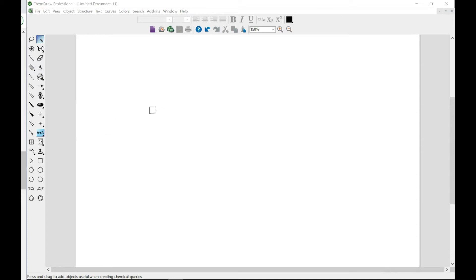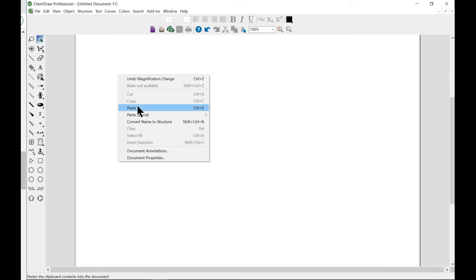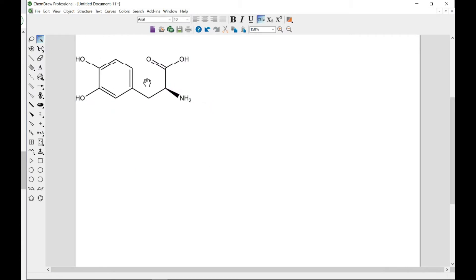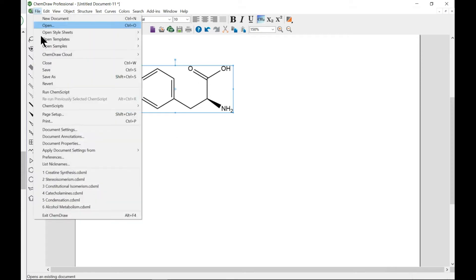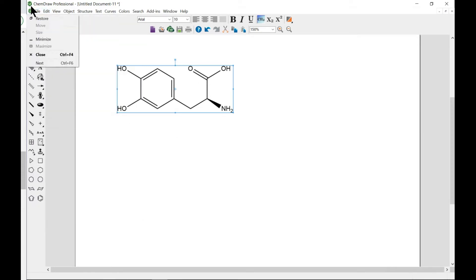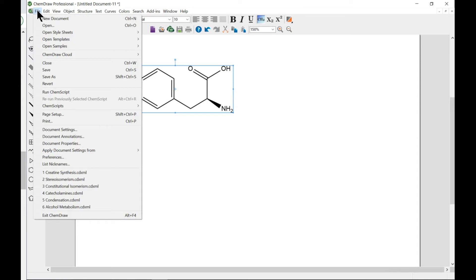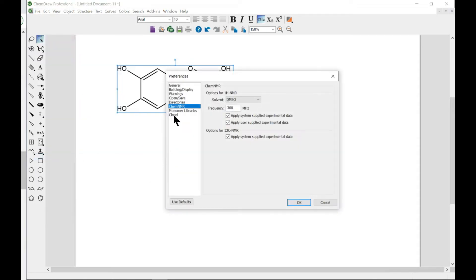Let's come in and paste our previous structure which we had from the template. Now when you head over to preferences, you come to file and preferences and come to ChemNMR, you see this tab.